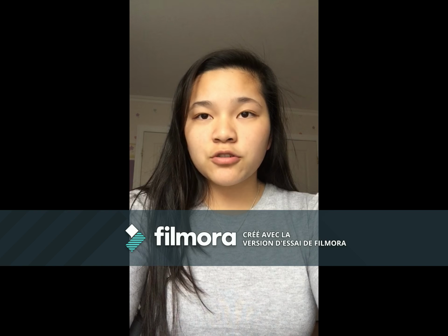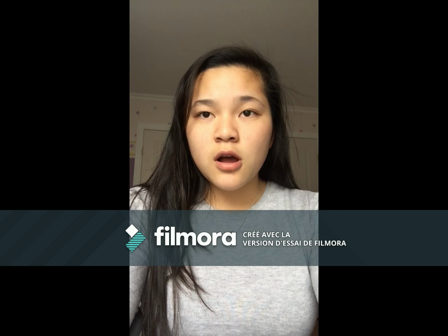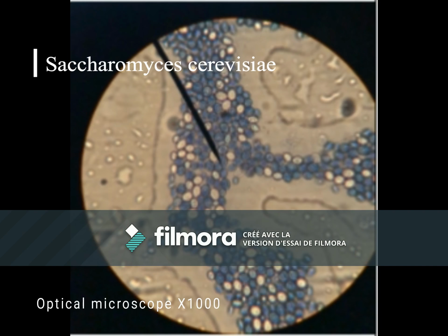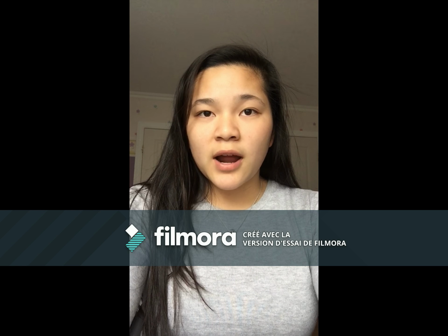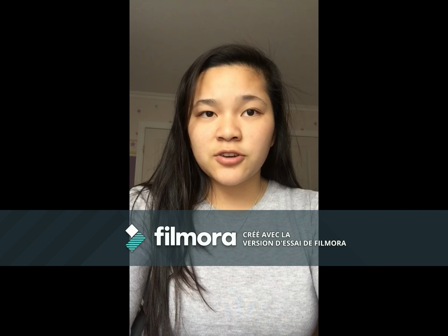Using the optical microscope at magnification 1000, it was possible to identify the nucleus, the cell wall, and the vacuole of the yeast cell. The same organelles were identified in addition to the chloroplasts for the C. vulgaris cell.